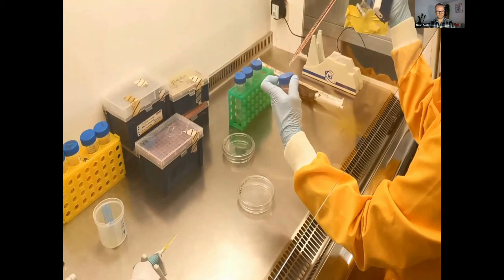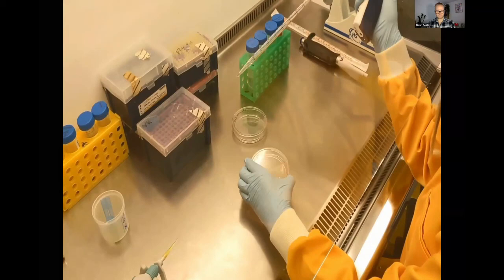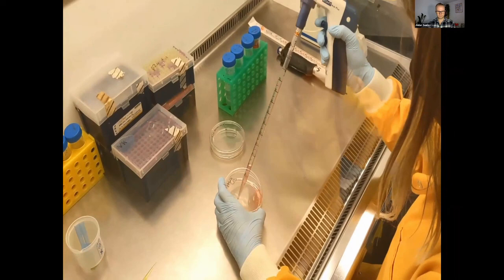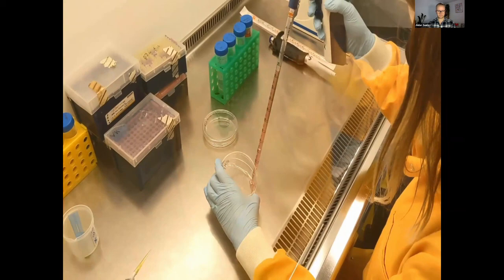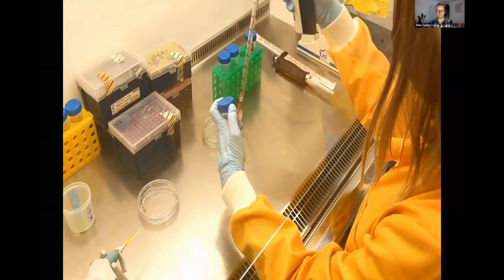Firstly, new growth media is added to the plate. The surface of the plate is washed several times with the media to make sure that all the cells are washed off the plate's surface and into suspension in the new growth media. Resuspended cells are removed from the plate and transferred to a sterile Falcon tube, where the researcher pipettes the media up and down to ensure the cells are evenly resuspended and not in clumps.